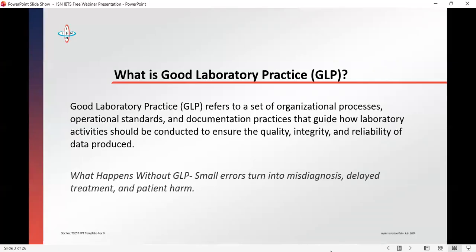We also have environmental variables that can influence our results, like temperature. If the temperature in your laboratory is not accurate enough, maybe your analyzer might not be working accurately. Also humidity, when the humid condition in your laboratory is not good, and even power stability. There are a lot of automated analyzers, and when your power is not stable, it can affect how those analyzers work, right? So those are environmental factors and variables that affect our laboratory results.